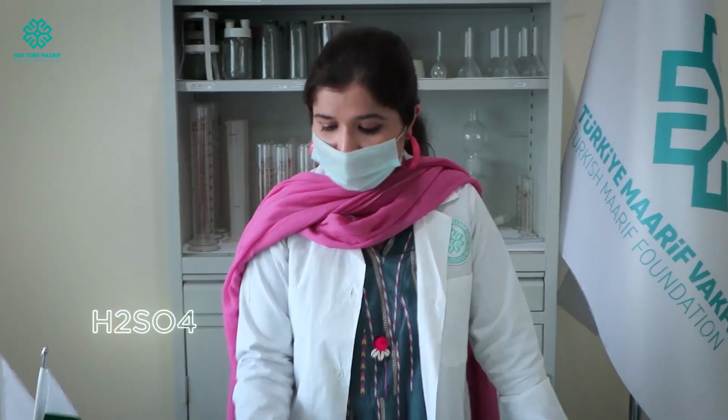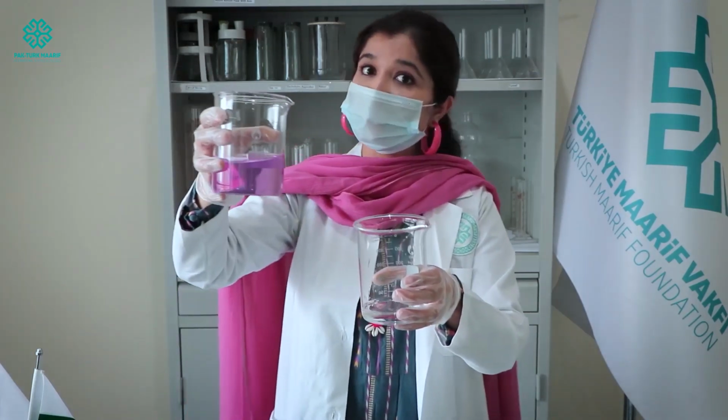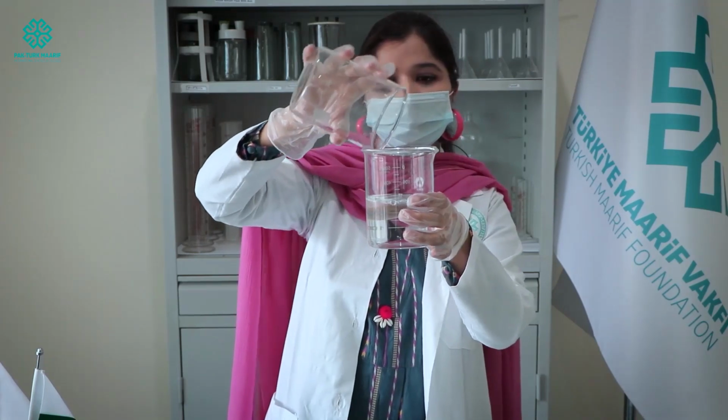Now I am going to transfer the solution of beaker 2 to beaker 3. Now what is in beaker 3? Actually, beaker 3 is filled with 15 drops of 1 molar sulfuric acid. Now I am going to transfer the solution, and you will notice that the color will disappear again. Now you can see that the solution is colorless again.